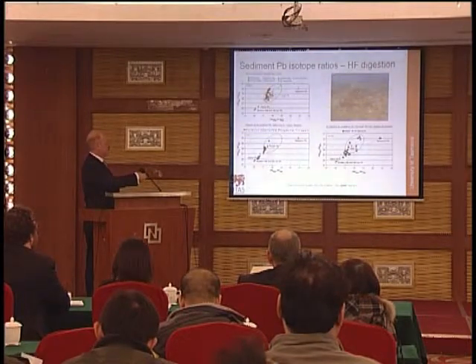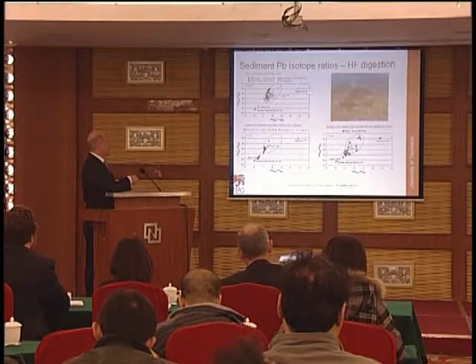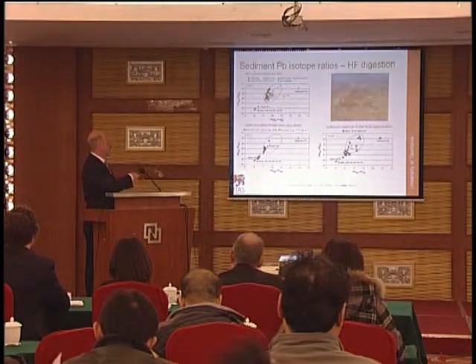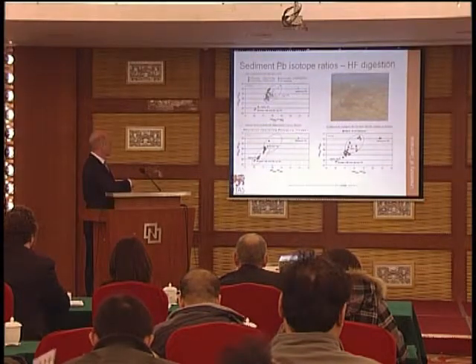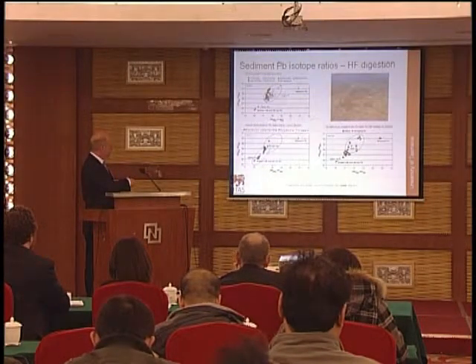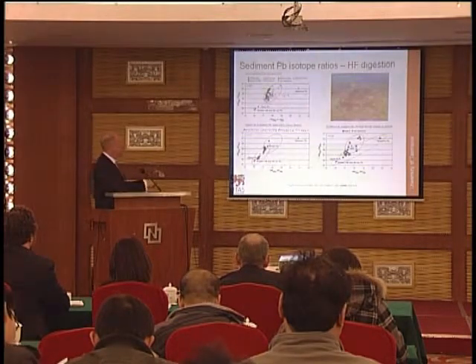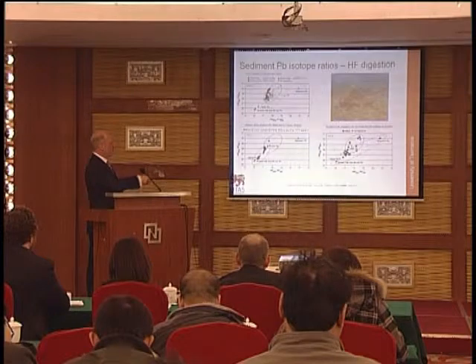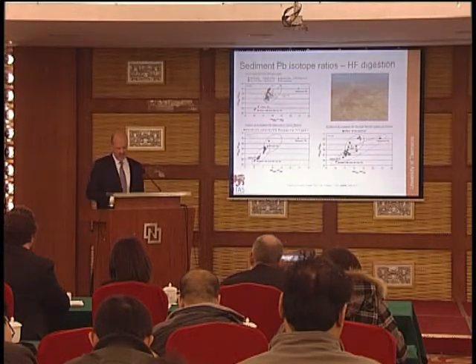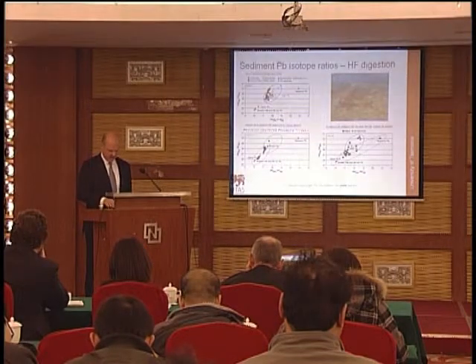And earlier work we looked at HF digestions of surface sediment grabs, rather than sediment cores, from the bottom of the bay, which looks a bit like this, which looks like a tip, doesn't it? Background sites where there's no waste like this fell into this ring, tracking down towards the Australian station. We can see the Australian lead signatures coming out of this background. And over where the Americans had been, even 50 years later, we can see this triangular plot between Australian lead, background geology, and over here, Missouri lead falling on this particular line. So I don't wish to blame my American friends, but if you'd like to help us out, that'd be great.